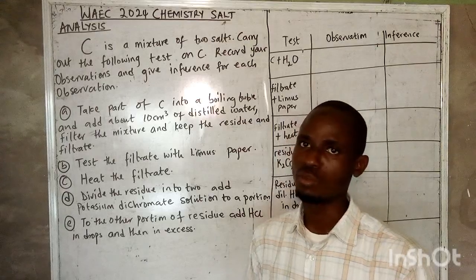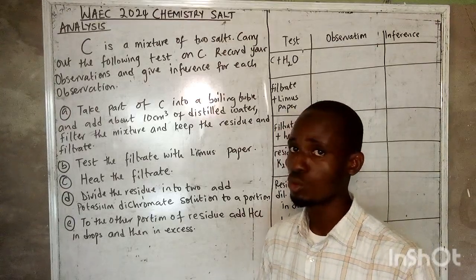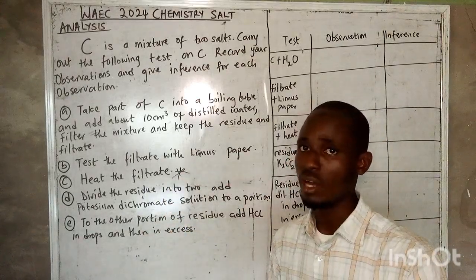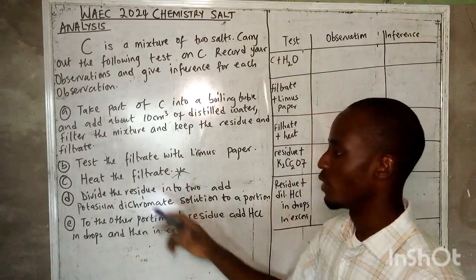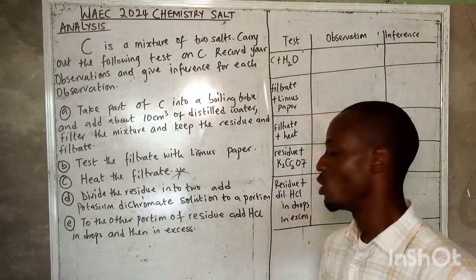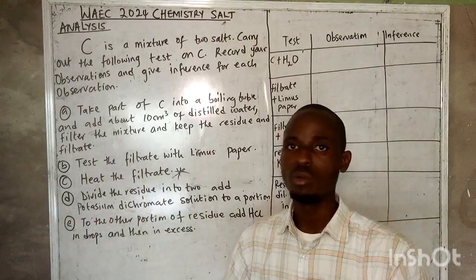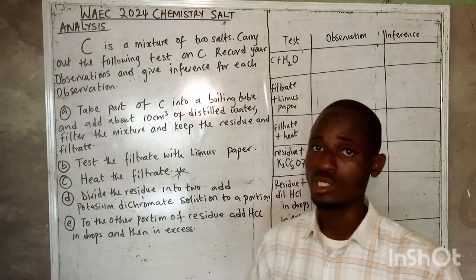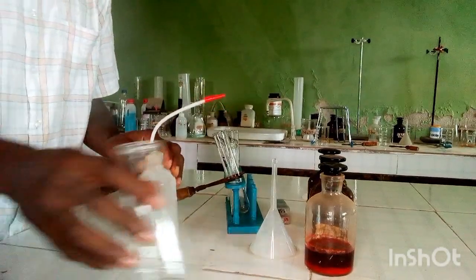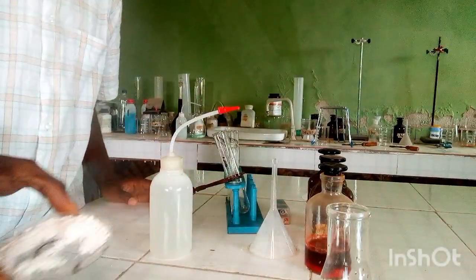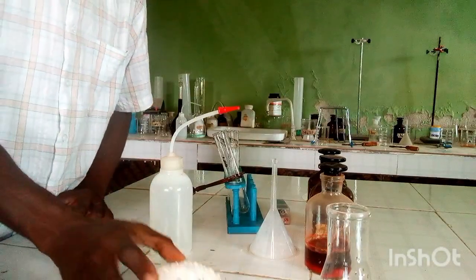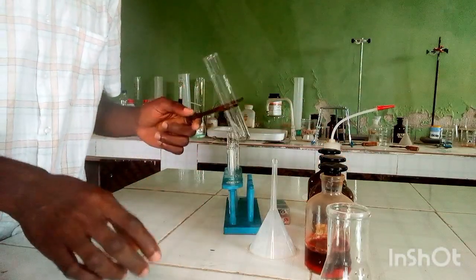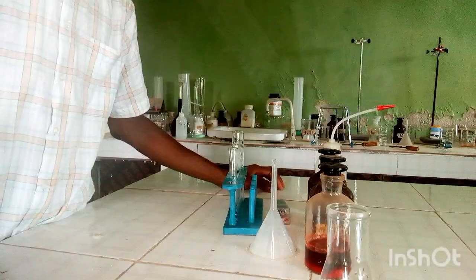The heating test I'm not going to do because the filtrate does not need to decompose, so we should be expecting no gas. Then we divide the residue into two portions: add potassium dichromate solution to one portion of the residue, and add HCl to the other part of the residue to see what happens. Now let's perform the tests. This is salt C — the mixture of two salts.